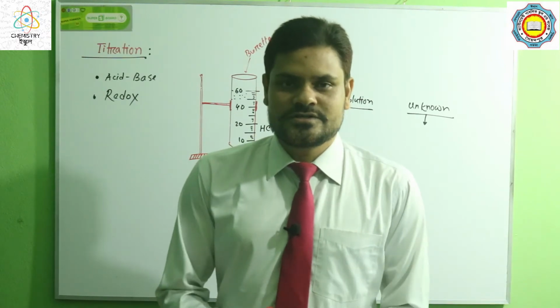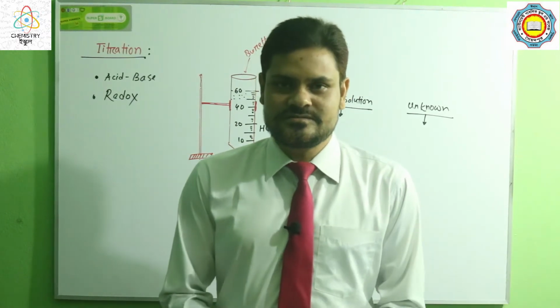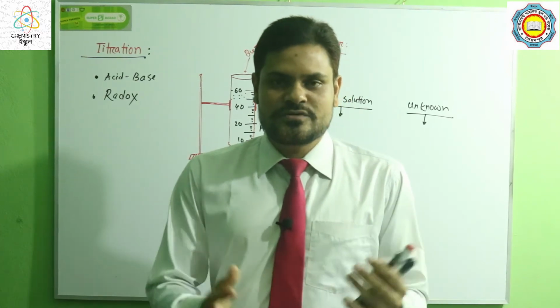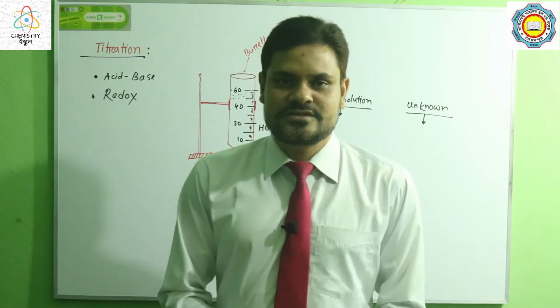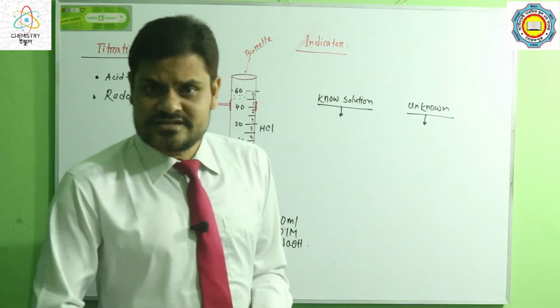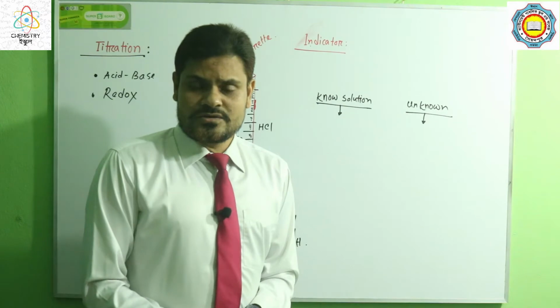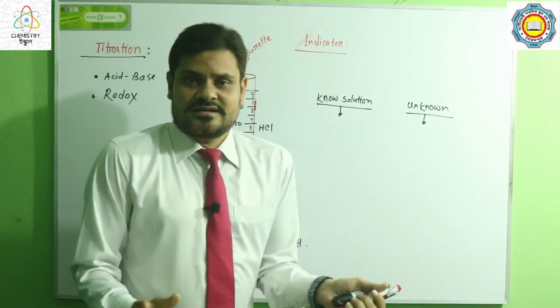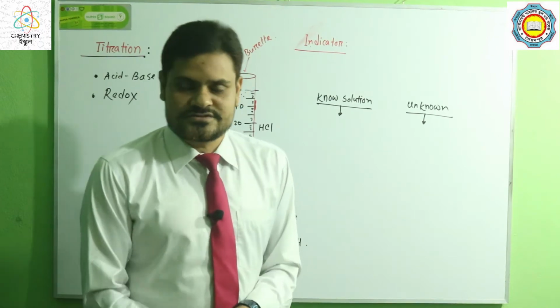Dear viewers, today I want to discuss titration, and I am going to give you some techniques regarding titration which will be helpful for you to better understand. Dear learners, what is titration? This is a measuring process. We can measure an unknown solution's concentration.